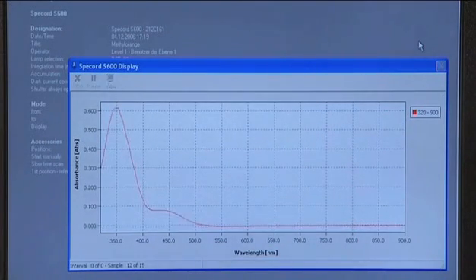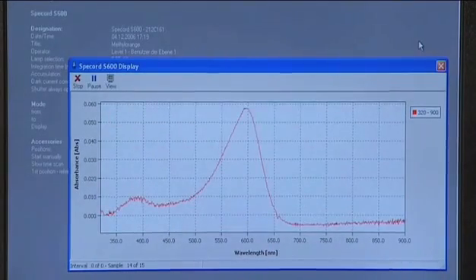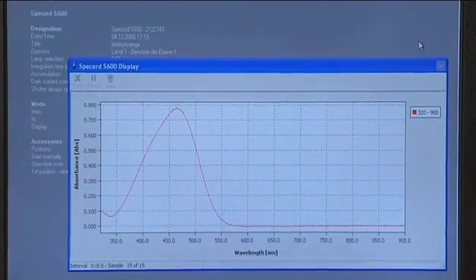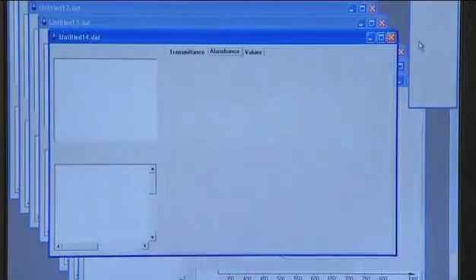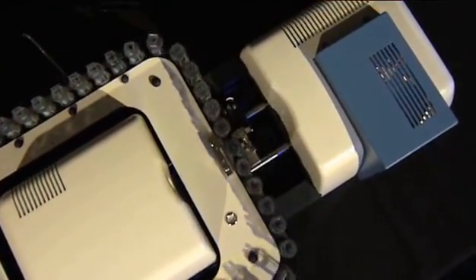An extensive range of accessories makes the spectrophotometer applicable to many different kinds of analytical tasks. Fully automatic measurements of 50 samples in less than 2 minutes is possible in combination with the unique 50-cell carousel.